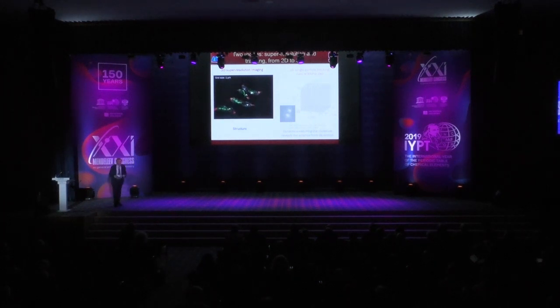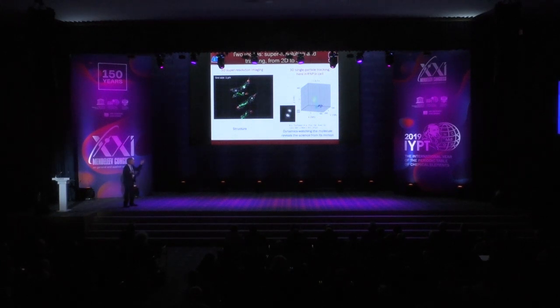There it is. Okay, but let me just emphasize that this trick of three-dimensional information also works for single molecules, of course, at low concentrations. So here I'm showing you what happens on the right with this thing that we call the double helix point spread function. And I'm showing you the motion of an object in 3 dimensions, even though the movie's not playing. That is a single RNA particle, actually, an RNA particle inside a cell nucleus that we can observe moving over a long time scale.